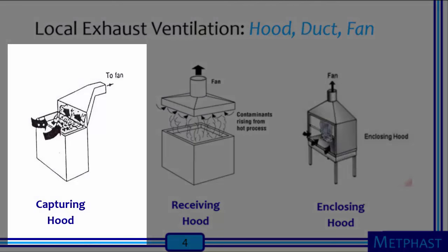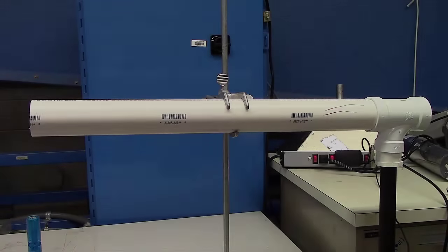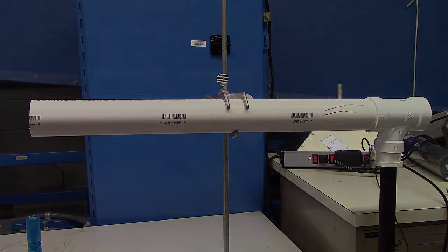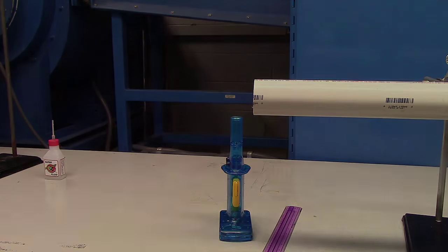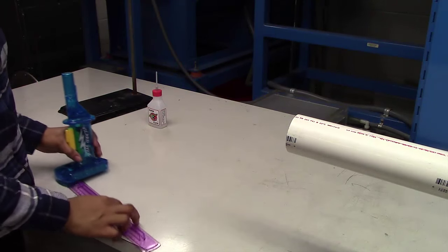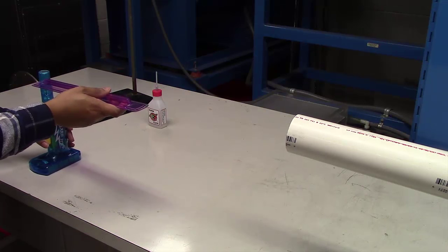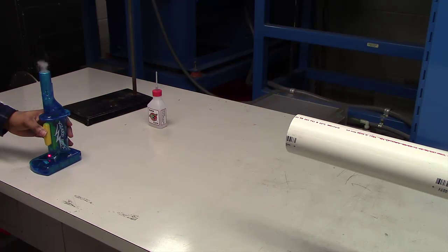We will begin by testing the effectiveness of the capturing hood. Capturing hoods are located near an emission source without surrounding or enclosing it. An example would be hoods used for welding operations or hoods by wood grinding benches. For the capturing hood setup, mount the PVC pipe assembly horizontally on the clamp stand. Adjust the height so that the pipe opening is at the same height as the wizard stick nozzle. Using the ruler to measure horizontal distance, move the wizard stick so that it is 2 feet away from the pipe opening. Turn on the vacuum cleaner and press the wizard stick trigger firmly to generate a steady stream of fog. Watch the movement of the fog and estimate the fraction that is captured.